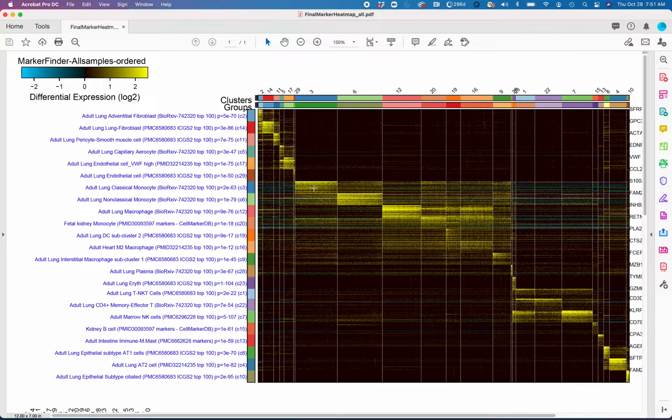So in this case, you have a number of clusters with the term monocyte, monocyte, macrophage, monocyte, DC, macrophage, macrophage, that are all very similar to each other transcriptionally and are all right next to each other. This is because the program is reordering the final clusters based on their similarity to each other, based on hierarchical or HOPACH clustering. Similar down here, you see other subsets of T cells and NK cells and B cells that are most similar to each other.